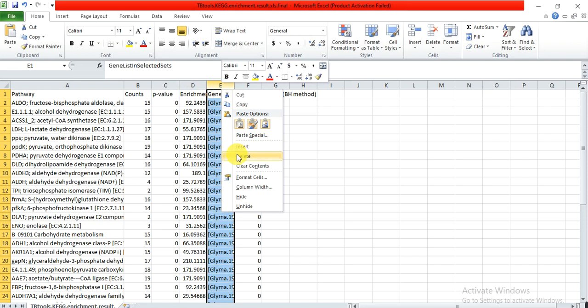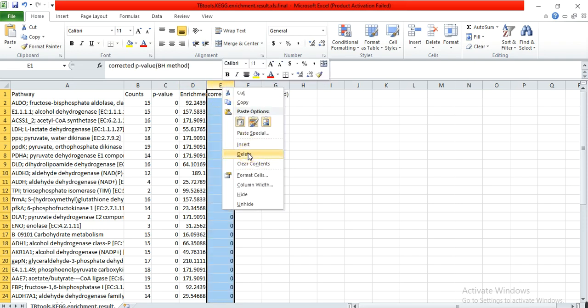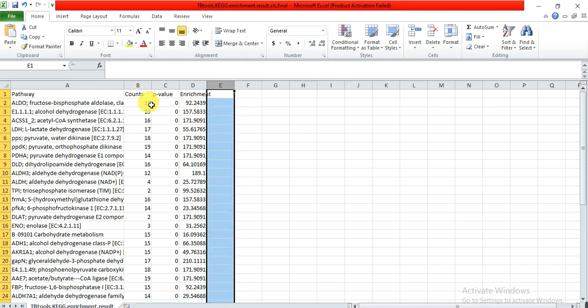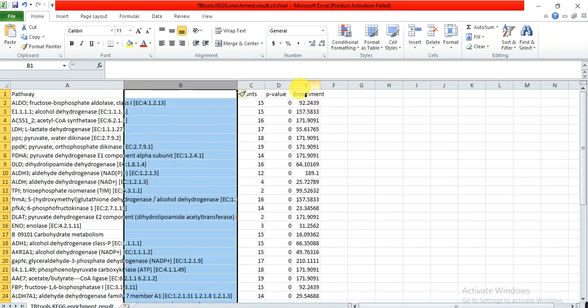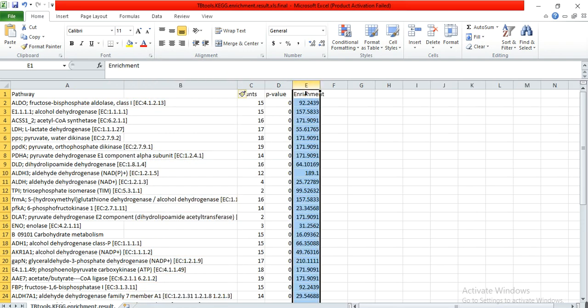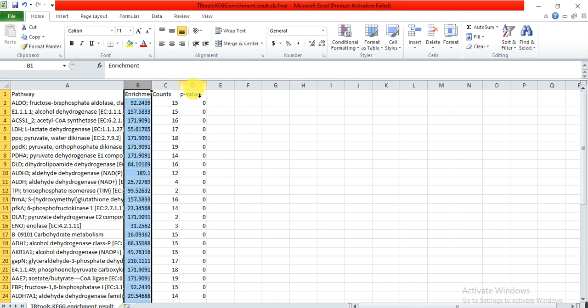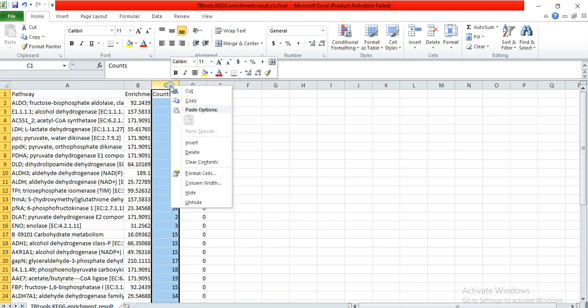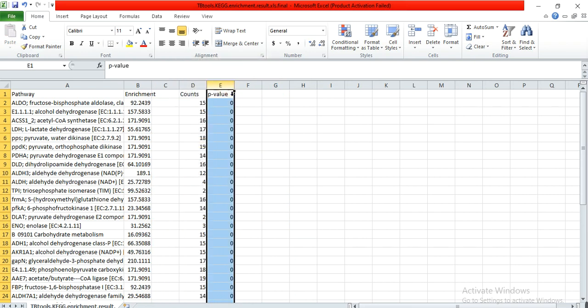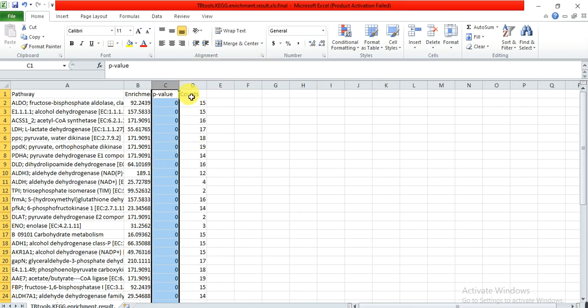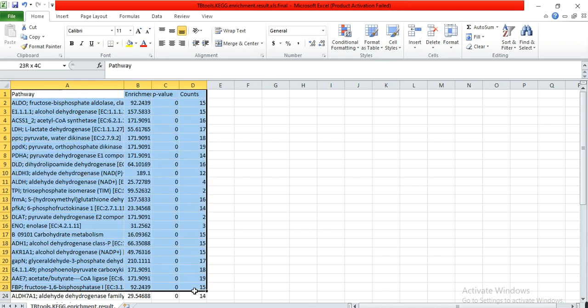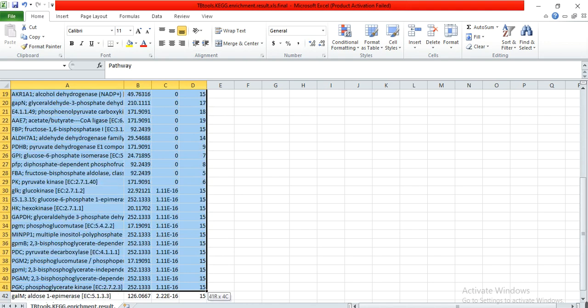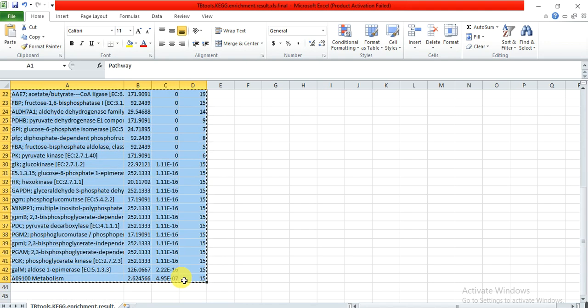These gene names we didn't need, so we delete them. The arrangement of these columns is: pathway in the first column, enrichment value in the second column, p-values in the third column, and then in the fourth column we put the counts.